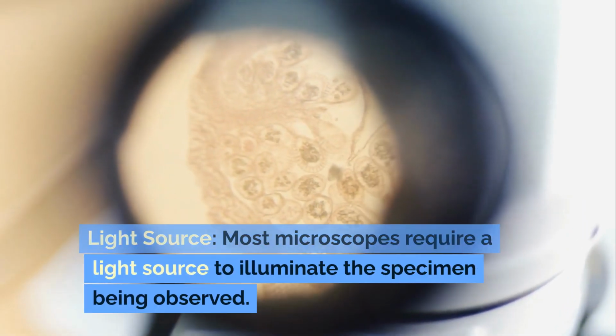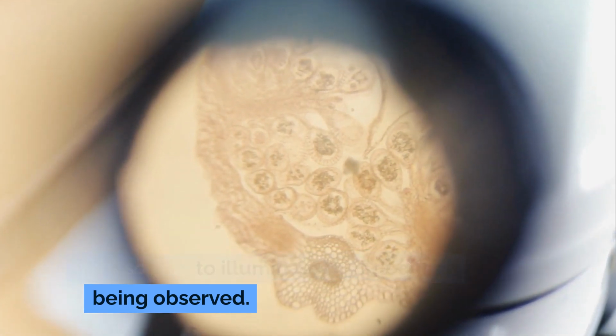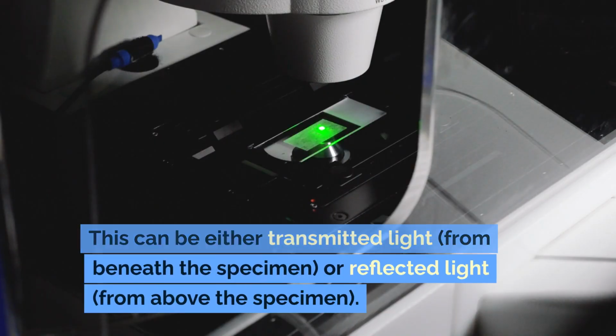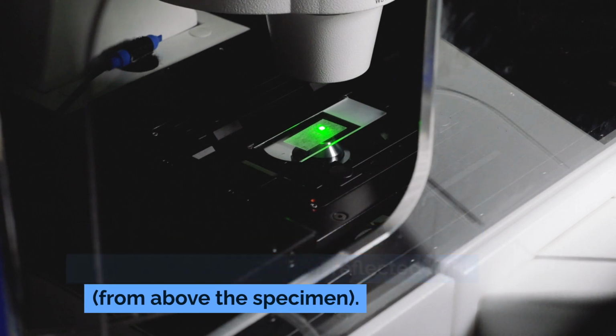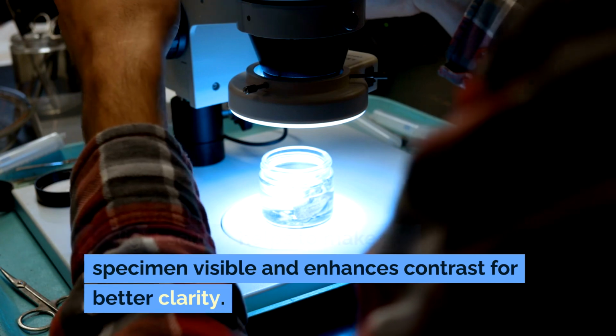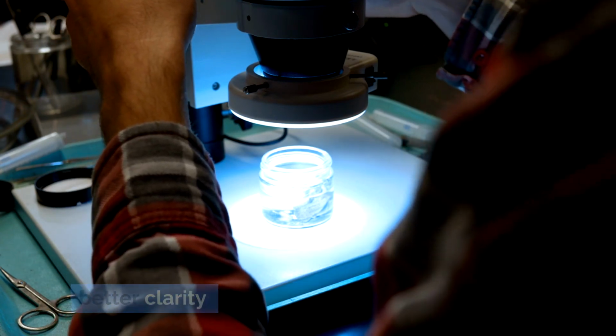Light source. Most microscopes require a light source to illuminate the specimen being observed. This can be either transmitted light from beneath the specimen or reflected light from above the specimen. The light source helps to make the specimen visible and enhances contrast for better clarity.